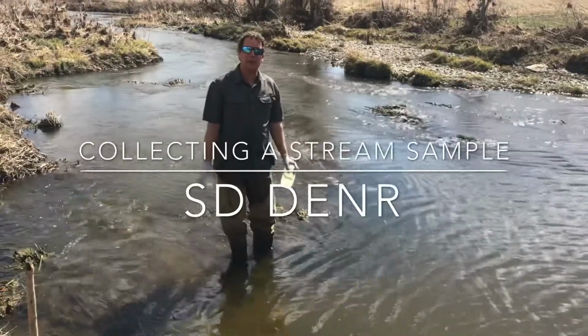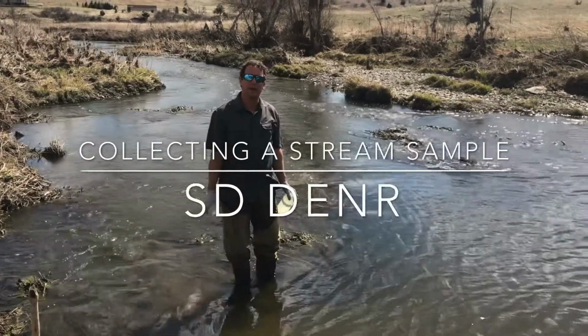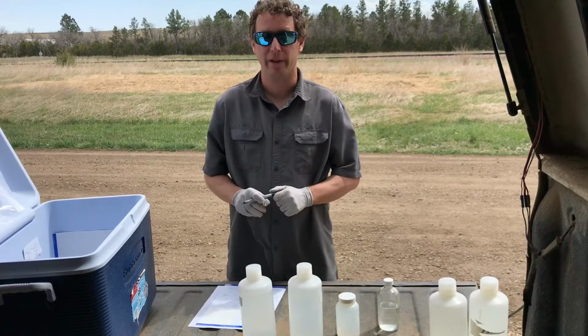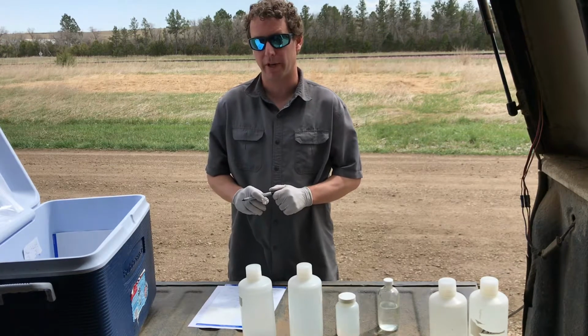Now we're going to take these bottles up to our pickup, and we're going to preserve our B bottle with 2 milliliters of sulfuric acid, and we're going to put our C bottle and our A bottle in the cooler. So now we're back at our vehicle. We've got our 3 sample bottles. We're going to label our bottles, fill out our data sheets, and preserve the B bottle with sulfuric acid.